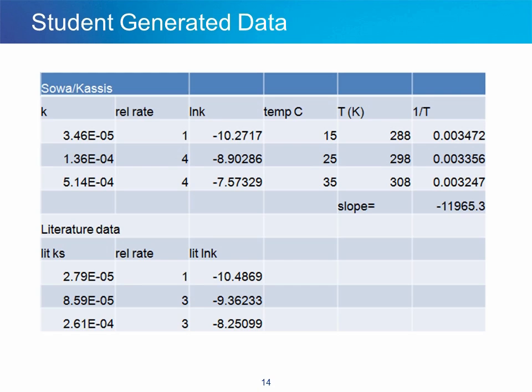I'd like to make a quick comparison to the literature data that is shown in Duncan and Pastow's 1978 JChemEd article. We can see that the literature rate constant values are comparable. They are certainly the same order of magnitude. There is some difference. It looks like the reaction is faster under the way that we perform the reaction. Not that much faster.